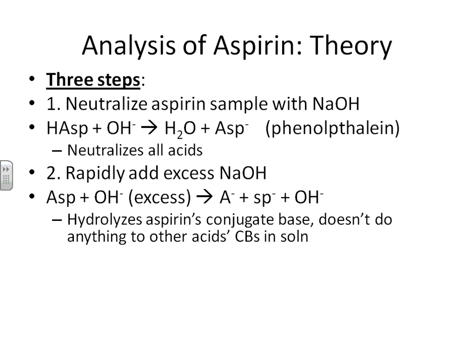Hydrolyze means to lyse something, to break something through the process, usually in water, but in this case the hydroxide is the thing that's doing the hydrolysis. The excess sodium hydroxide splits apart the conjugate base into two components, and notice we have additional OH minus left over. Now, the excess hydroxide ion doesn't do anything to the other acid impurities that we know we have in the sample. It does not hydrolyze them. So this is what is specific to the aspirin acid on its own.